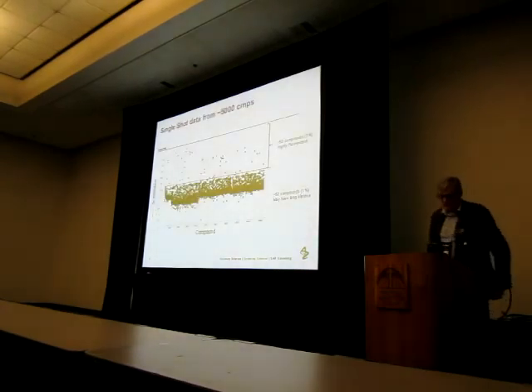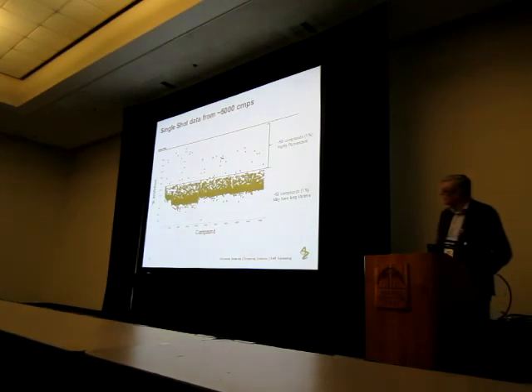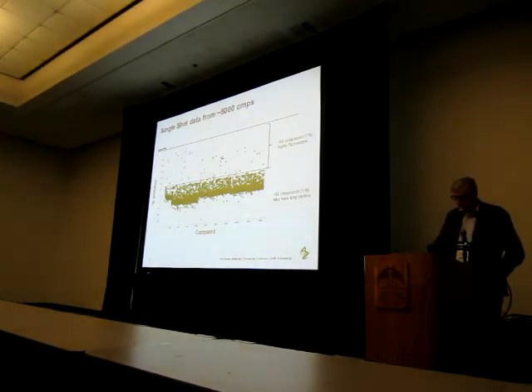And here's the data from the single shot. We had off-plate controls for this, so we set up a different set of controls on a separate plate for each of the plates that we put through the reader. And these are clustered in, there's basically 3 full plates and a part full plate.